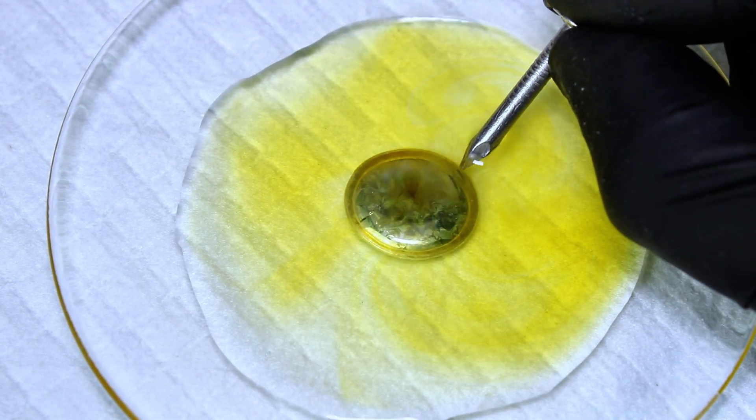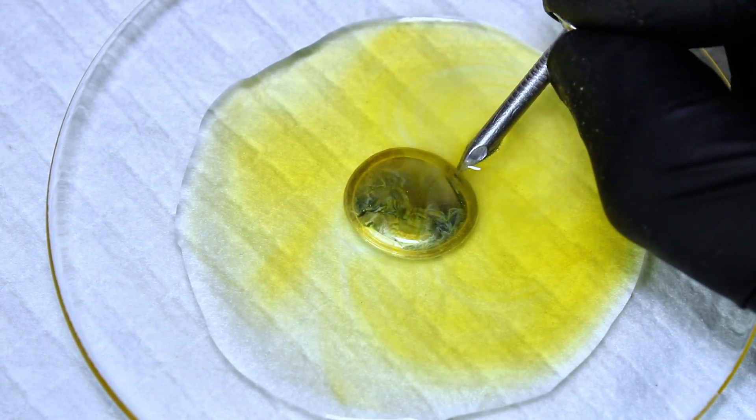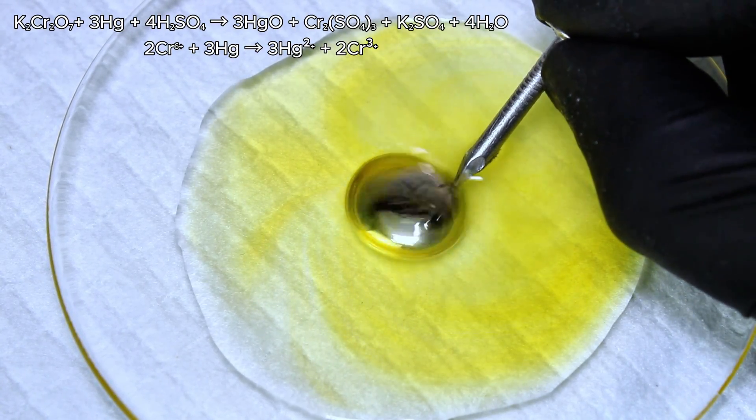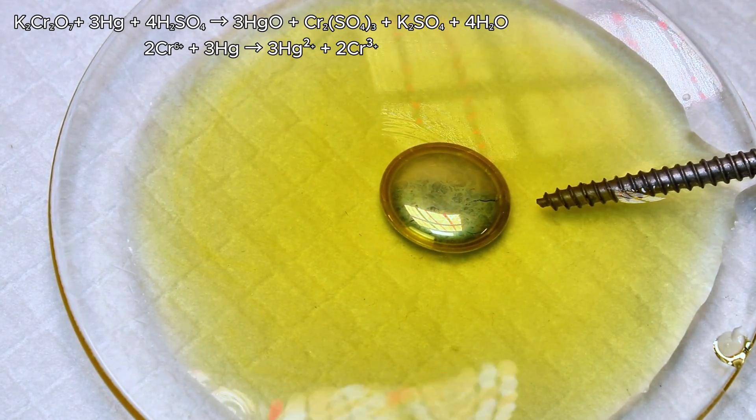What's happening here is a repeating series of redox reactions that begins when the dichromate comes in contact with the mercury. In this first reaction, dichromate is reduced to the chromium 3 ion, while mercury is oxidized to mercury oxide.